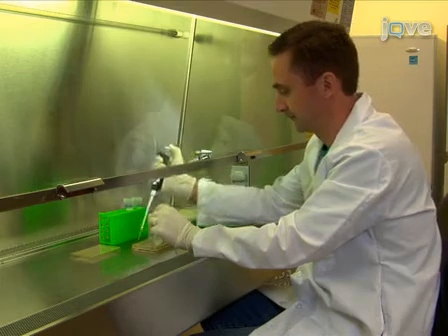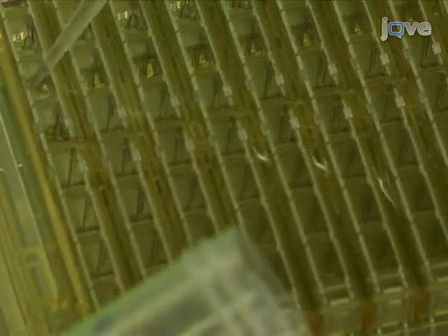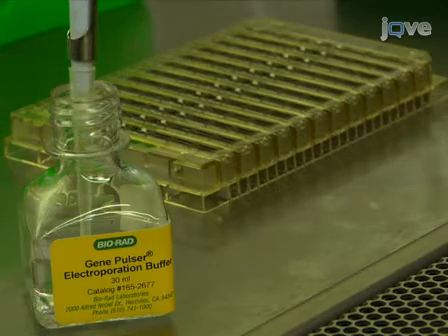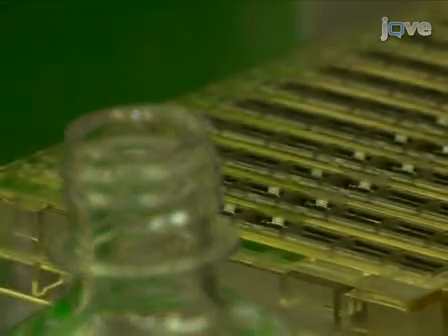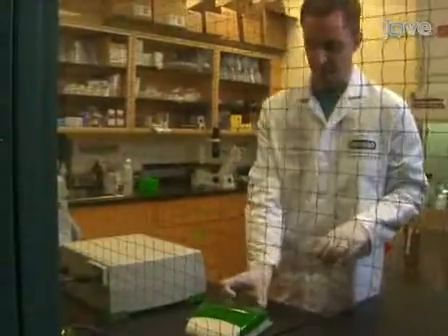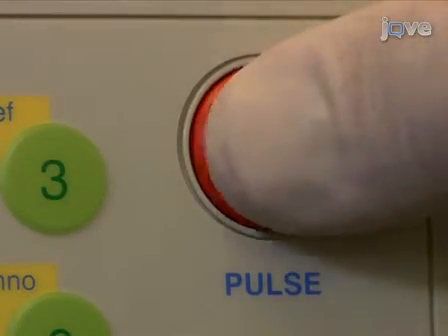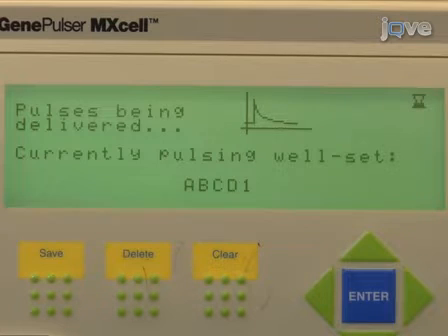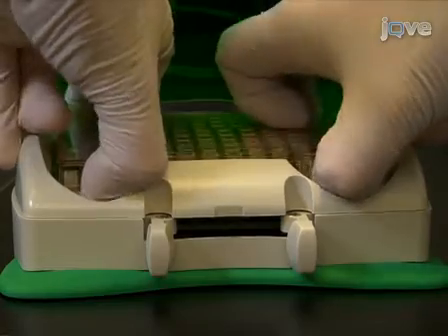The next step is to load 150 microliters of cell plasmid mixture into each well being used. For this experiment, the fourth well of each well set being used is filled with electroporation buffer. After loading the plate, place it into the MX cell plate chamber and close the lid. Then press Pulse to electroporate the cells. The electroporator delivers the electric pulses sequentially to each well set according to the conditions specified in the chosen protocol. It takes a few seconds to electroporate all the cells. Once the pulse is complete, remove the plate from the plate chamber.